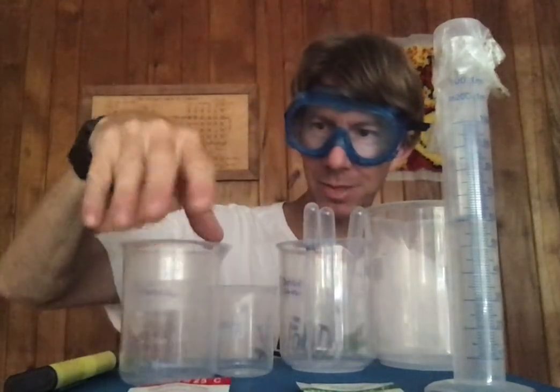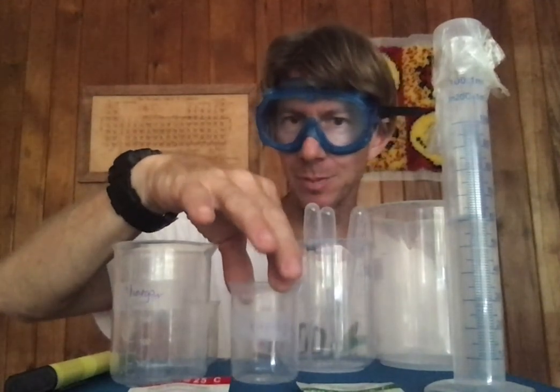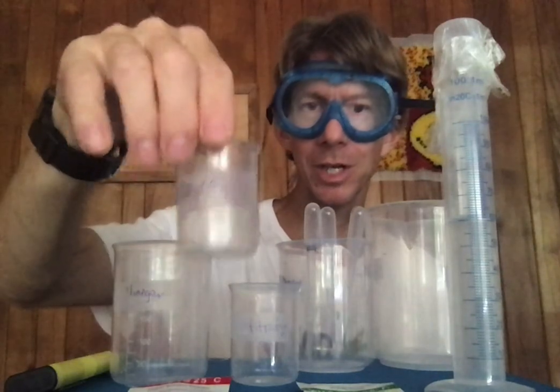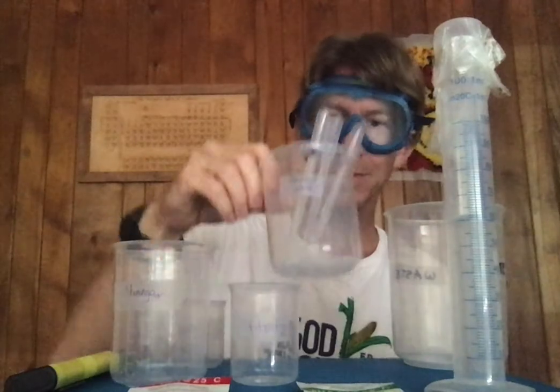You can see I've got a bunch of labels here. Vinegar, I did my titration in my 100 milliliter beaker. I had my sodium carbonate in my 50 milliliter beaker, my waste beaker, my distilled water for rinsing things, and I did just run the experiment.